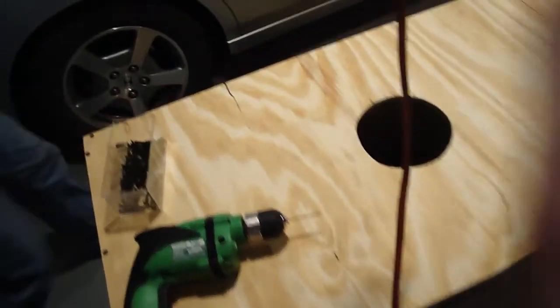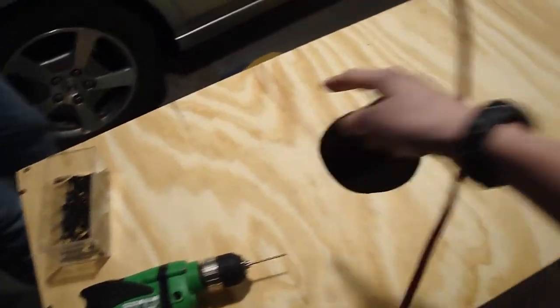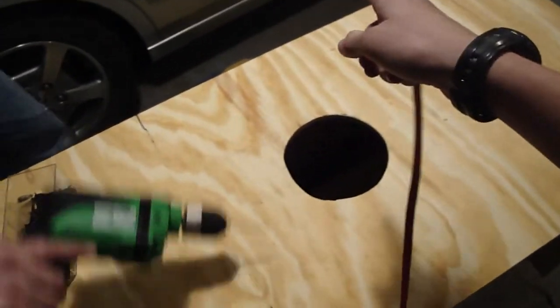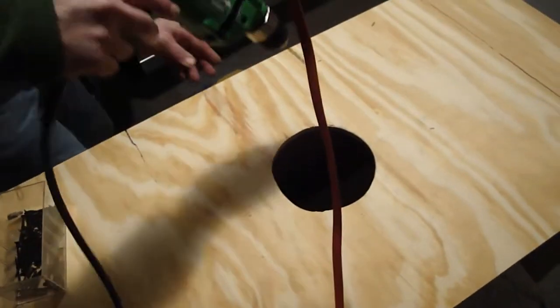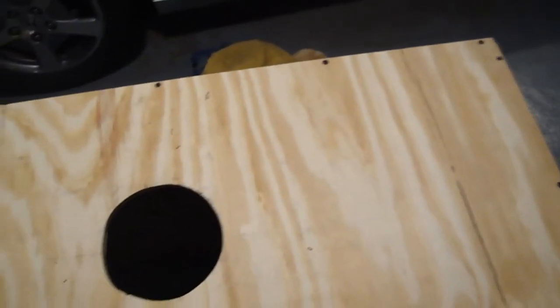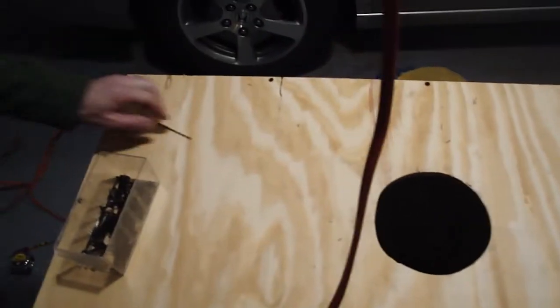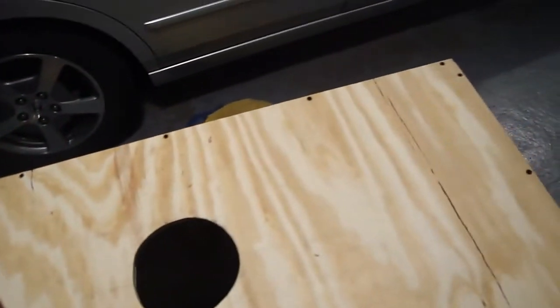Now we're going to put screws along the back side. So we went ahead and just put five screws across the back there. That should be constructing the box. We'll just have to put the plexiglass on the front.